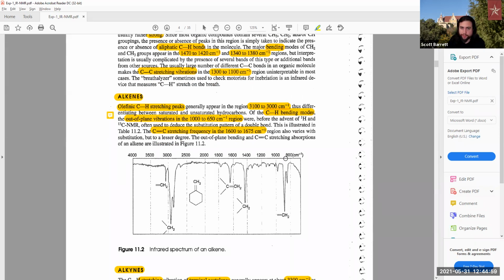It's between those two. You have an alkene bond with a pretty strong peak there. That's pretty obvious. Whenever we say strong, you can see this very deep peak here. And we would say it's weak if you're talking about peaks like in this instance, between 1,000 and 1,200. It's maybe a little bump here and there. But in this analysis, you can see they go very deep, and that's very significant for us to clarify that's a very strong functional group there.